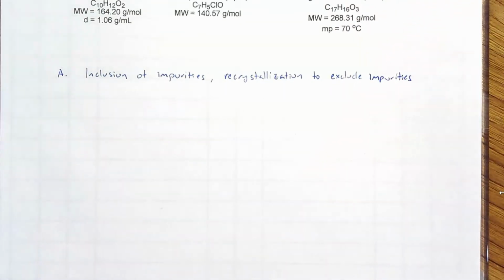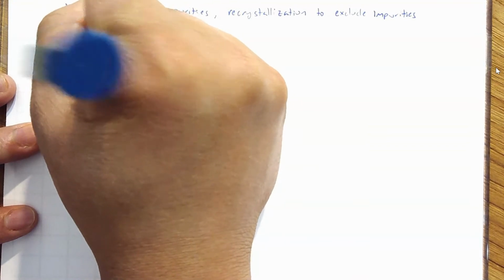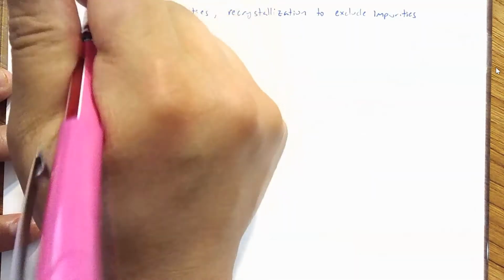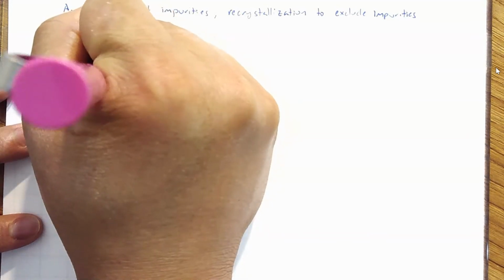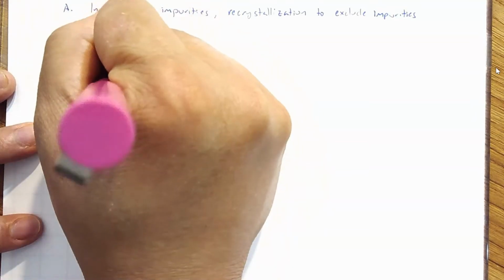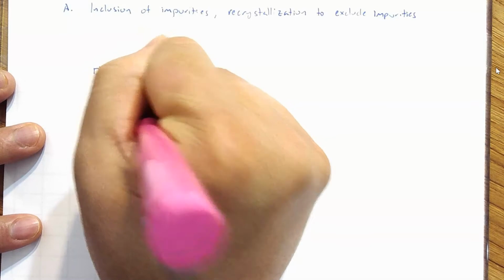Let's say our eugenol benzoate is represented by these blue squares, and normally when it's a solid, it's going to be a pretty ordered solid. But if you have impurities, and we'll represent that with triangles, those impurities can form defects in the crystal. Defects caused by impurities.